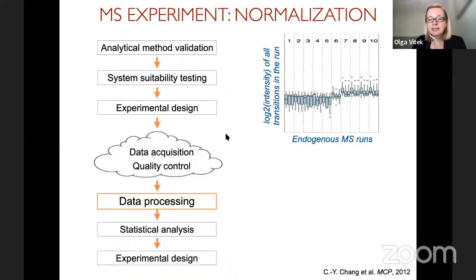And so this is one example of a QC plot that MSstats would generate. Here the x-axis is mass spectrometry run. This particular experiment is a time course with 10 time points, and the vertical lines separate time points. The actual order of acquisition was randomized, but now for the purpose of presentation, we reorganize them by condition.